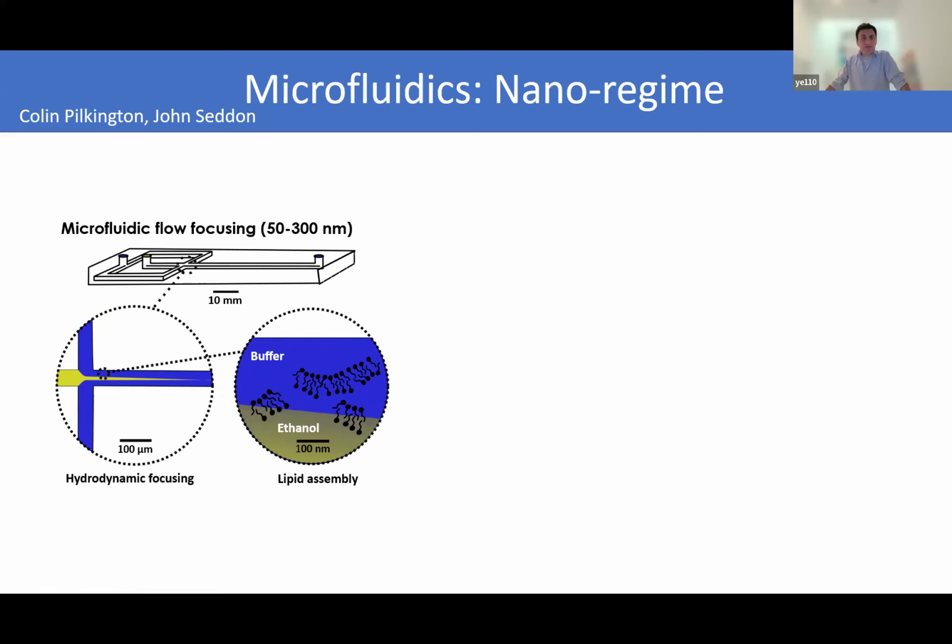So to do this, we turn to microfluidics again, but in this case, instead of droplet microfluidics, we use a technology called hydrodynamic flow focusing. So everything's continuous. There are no droplets, because there's a limit to how small you can form a droplet. You can't form a nano-sized droplet using traditional droplet microfluidics. So we formed a system which is a bit more reliant on self-assembly.